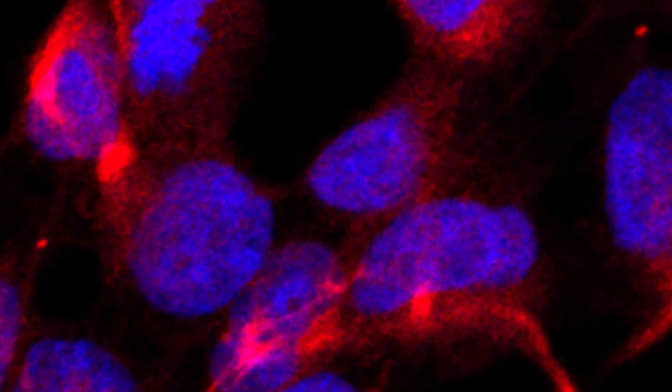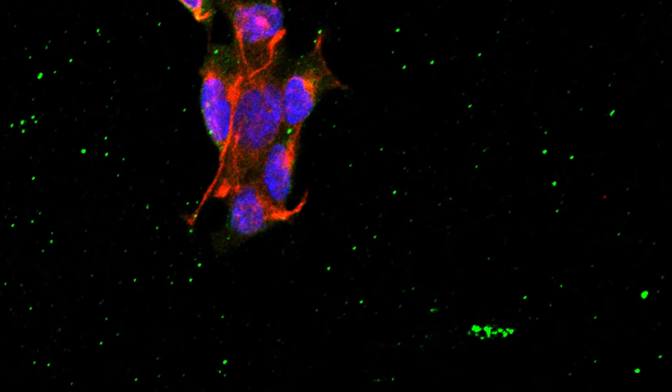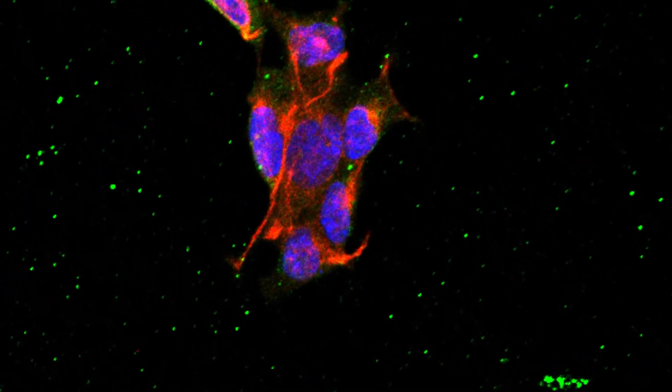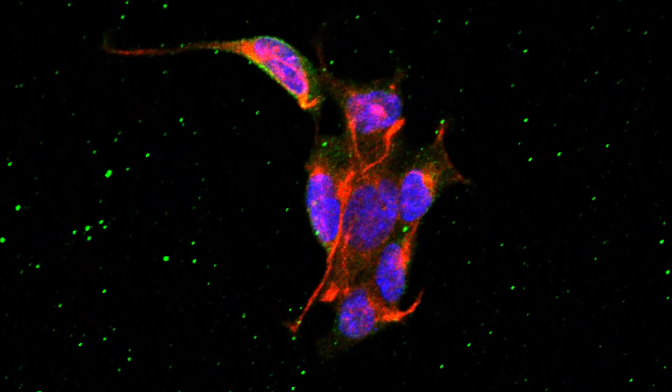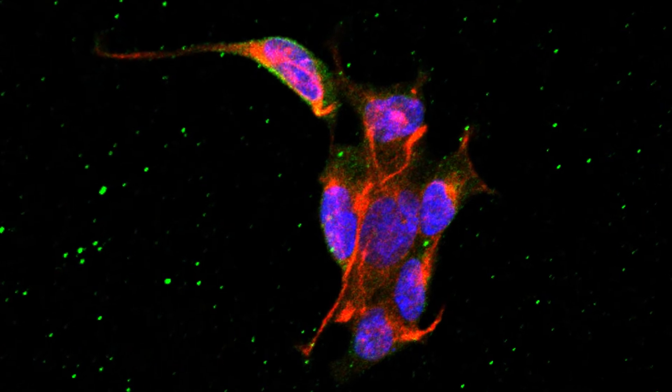Before the confocal we used another type of microscope that would only allow us to look at it from one plane, from one field of view. But with the confocal we're able to look at it in 3D and take a Z-stack image, which means we can go through the cell in different slices.